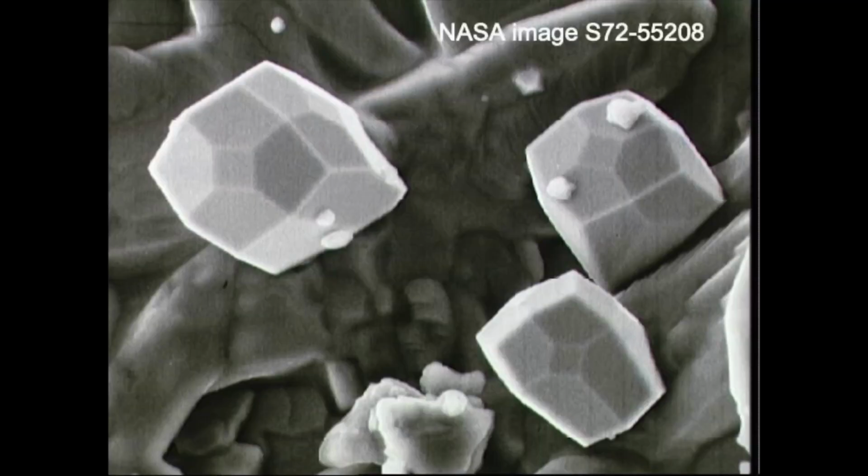Well, these iron crystals are interesting in the sense that they are very small iron crystals that you can only see by using techniques such as scanning electron microscopy. They are of the order of 1 micron in size, so they're far less large than the width of a human hair, to give you some feeling of dimensions. And so you have to use something like a scanning electron microscope. Fortunately, even in the early 1970s, there were chemical analysis facilities available in these microscopes, and they were able to establish beyond reasonable doubt that they were essentially pure iron crystals. You could argue there's 0.5% nickel, but essentially as an impurity, but it's essentially pure crystal.